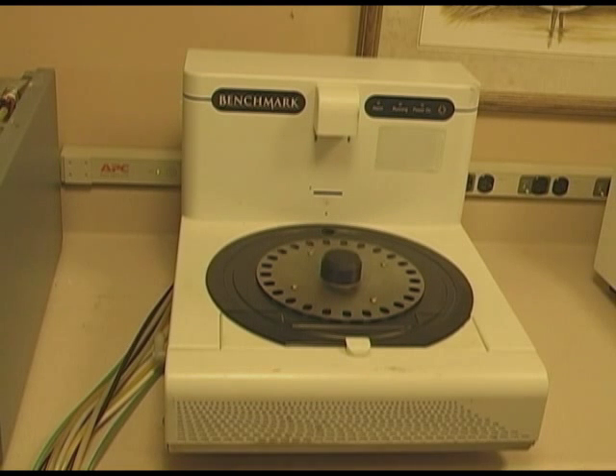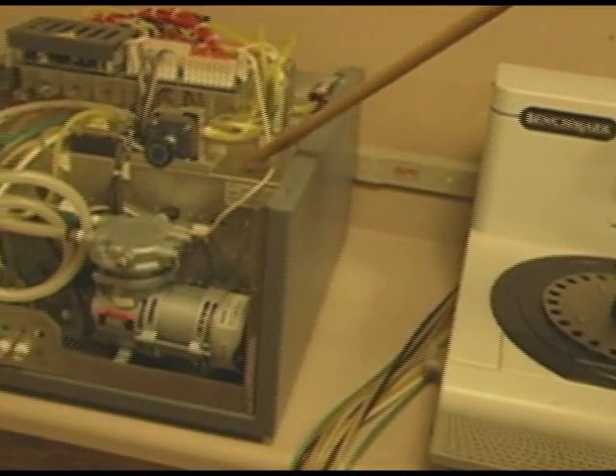The slide stainer consists of three different components. One is the computer, which we're not going to show here — it's just an ordinary desktop computer. The other is the fluidic module.